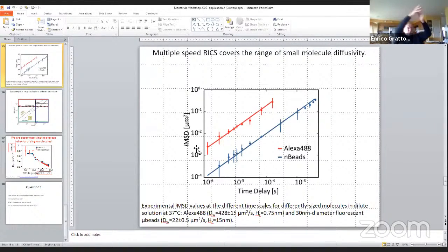Well, PCF of course gives you the directionality. Okay, but it's based on scanning, and the scanning is much faster. So the only technique which is similar is using the airy camera.